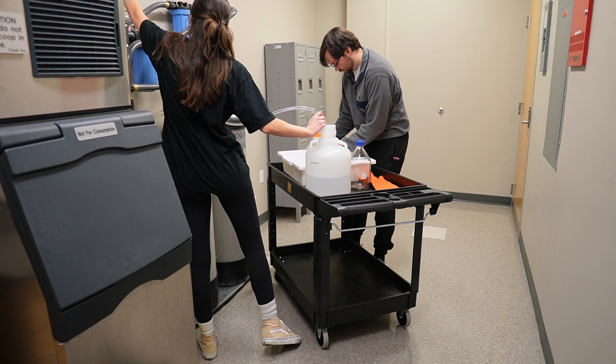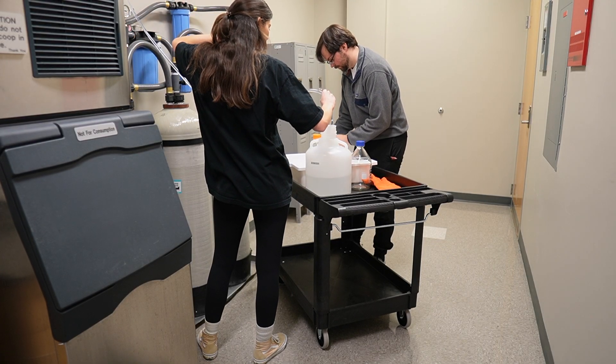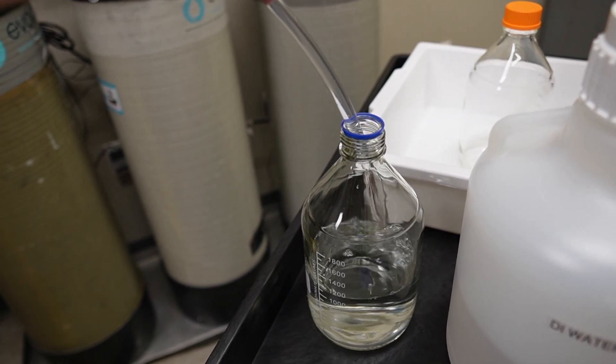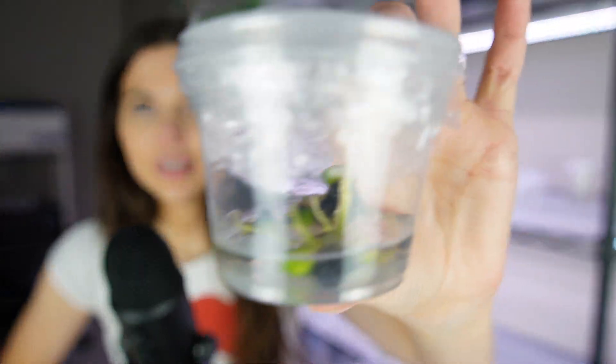Before I get into talking about my laboratory, the clips that you see in this video are videos of me subculturing the corpse flower. Last year I put my corpse flower — aka Amorphophallus titanum — into tissue culture and it's been doing something. Here she is.